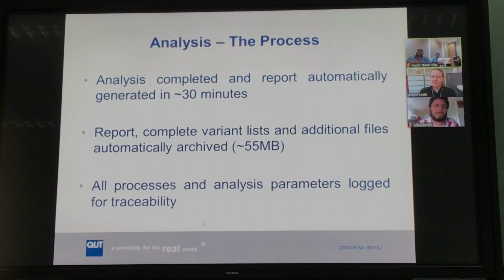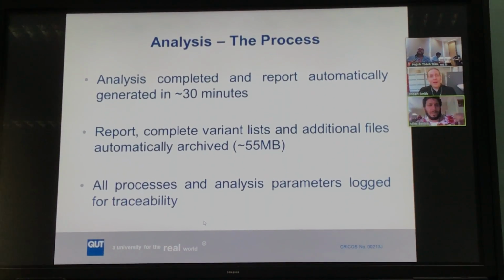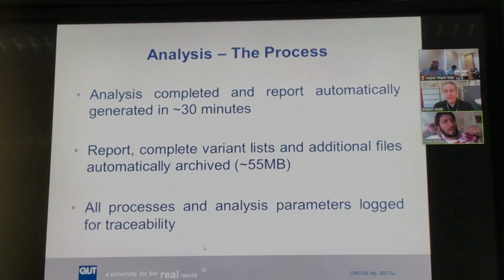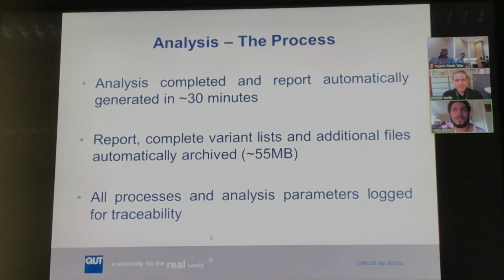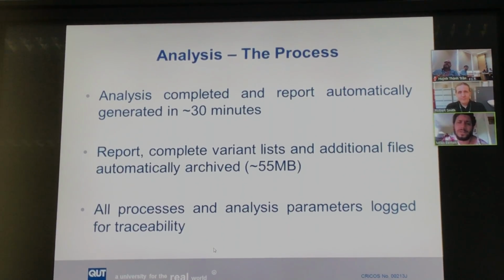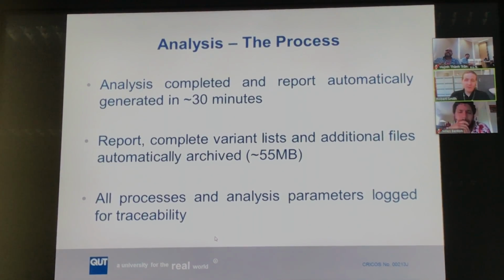Yes, about 10 minutes, isn't it now? It's about 10 minutes now. Depending on the size of the return, and the number of samples, the quickest it's done is about 10, and the longest it takes for the largest experiment we have is about 20 minutes. So that's good. So it's nice and fast, which is always a bonus.